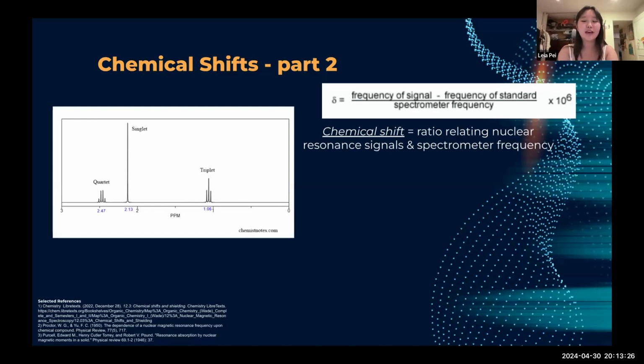Chemical shift values form the x-axis of any NMR spectra, and NMR spectra can then be used to determine the structure of compounds through specific techniques, such as integration of the peaks, which can tell you how many nuclei gave rise to each signal peak, or observing the splitting within each peak, which can then tell you information about the neighboring atoms, as well as the chemical shift values that are denoted by the x-axis, which can then tell you how shielded each nucleus is.